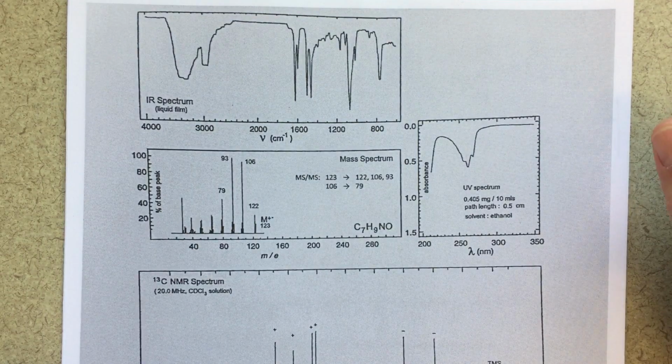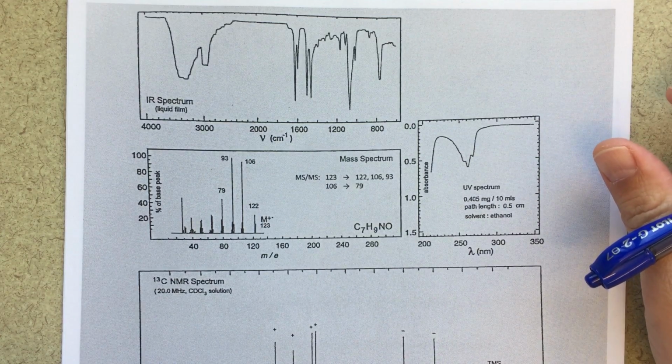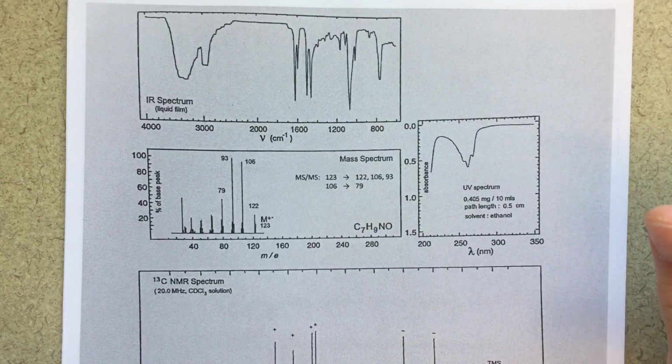All right, welcome back. So we have another requested video here. I've got a variety of IR and NMR and mass spec data that I'm going to analyze and come up with a plausible structure for.